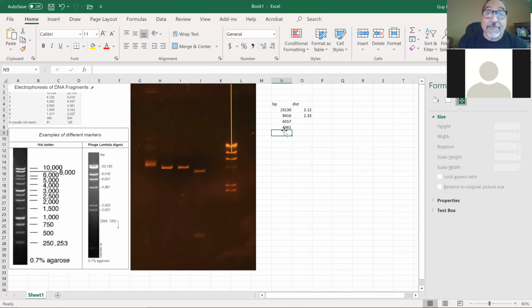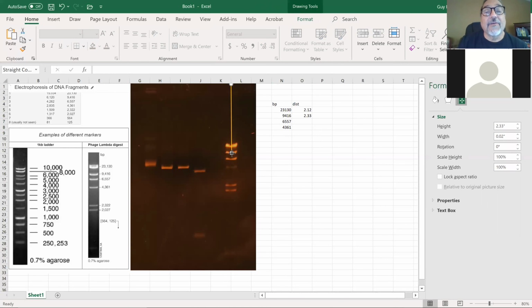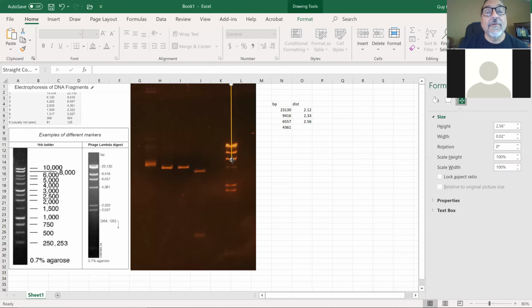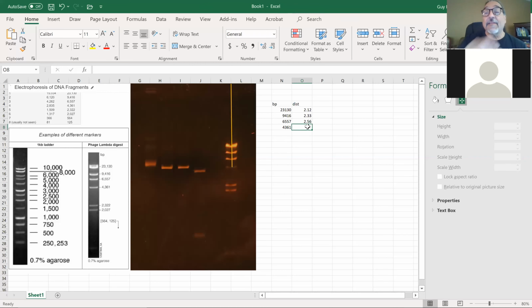Oh, yeah, absolutely. Okay. So again, I'm going to go through here, go to the next one, 2.56. Go to the next one. And again, you just got to try to keep it straight as you can.